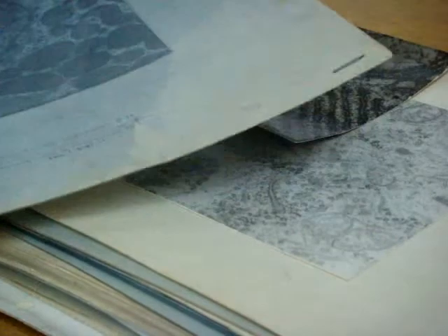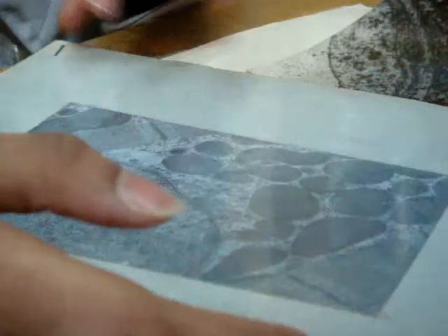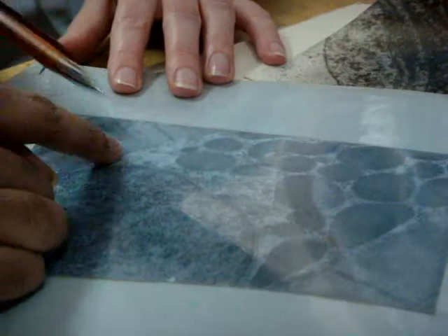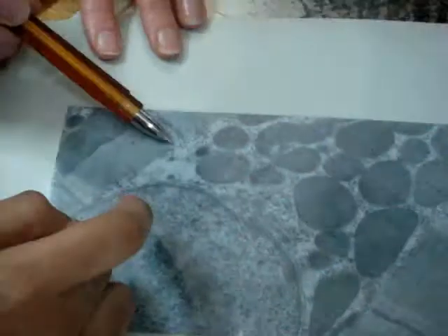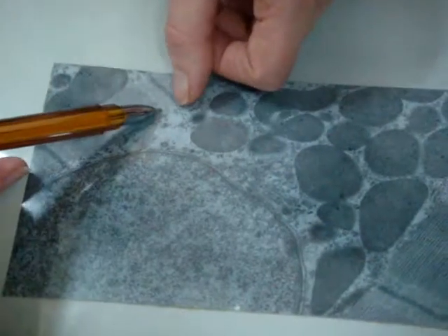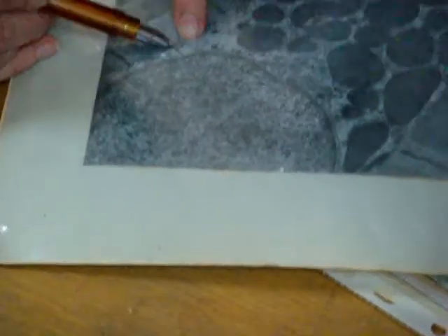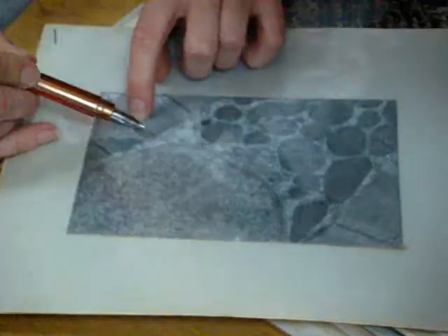Teacher, can you identify the A band and I band here? Yes, if the teacher asks, you should identify the Z line, this A band, this I band. Again, these two Z lines, this one sarcomere. Each sarcomere consists of one A band and two halves of I band. And this is the H band, and in the middle the M line.